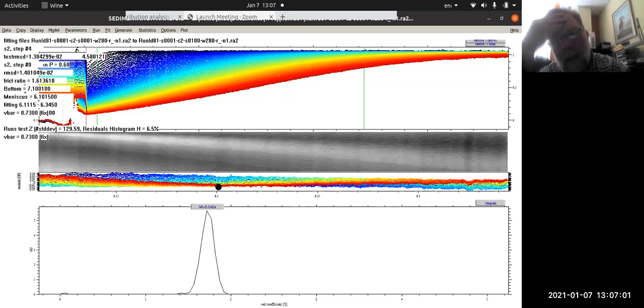The other important thing to say is that when you're doing an experiment and you're loading data in, this rainbow color, besides being just cool looking, it's important that you have a rainbow that accurately reflects the entire range. When you're running sedimentation velocity, you want to make sure that you spin things as long as you dare, meaning that if you don't need the protein back again, your best bet is to make sure it's a smear in the bottom of the tube at the end of the day. So you could do a run for much longer.